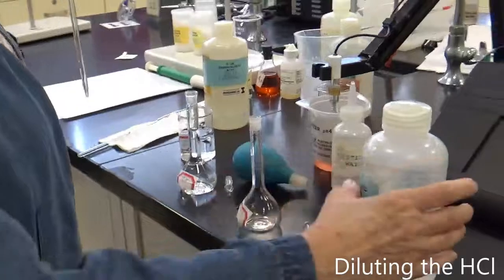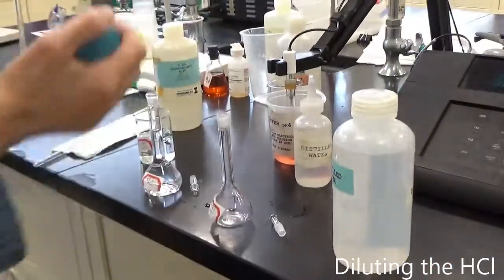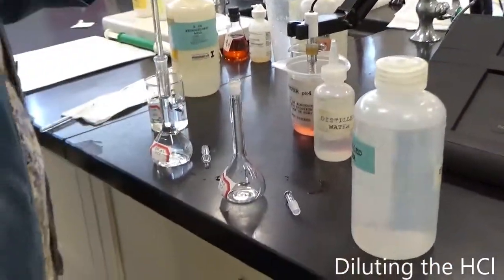Keep track of my caps here. And get 5 milliliters here.